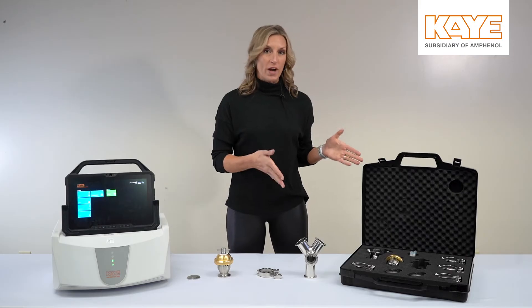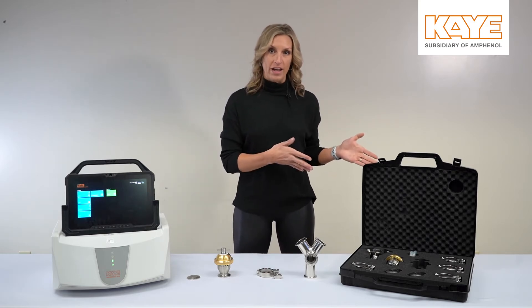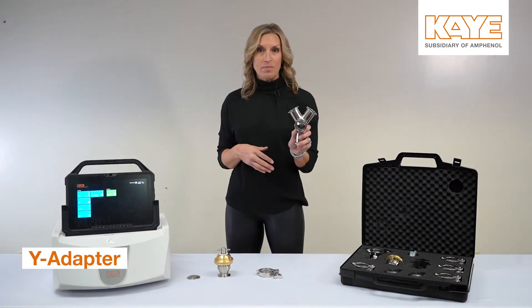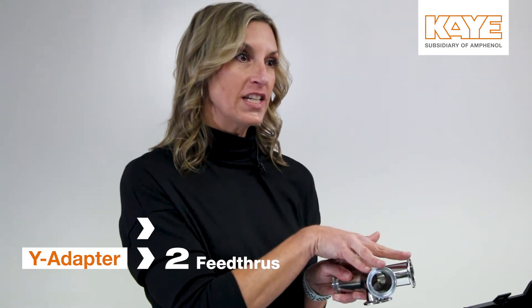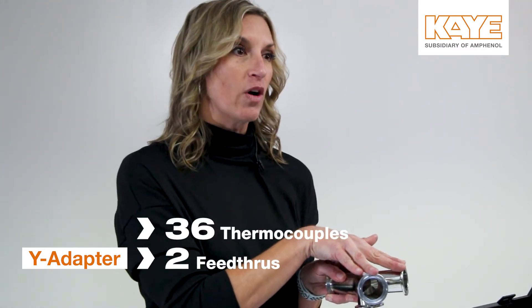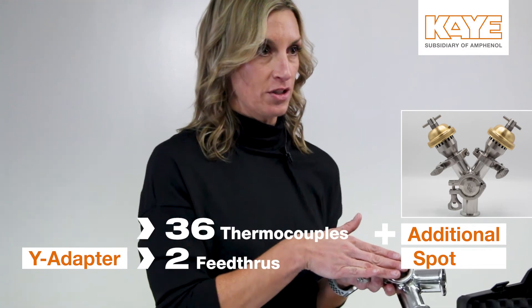This is a great resource when you're trying to map more than 18 thermocouples within an autoclave. The Y-adapter allows you to connect two feed-throughs, getting you up to 36 inputs, and we also have a spot for either another feed-through or your pressure transducer.